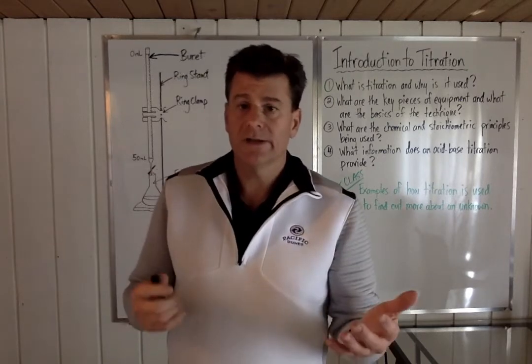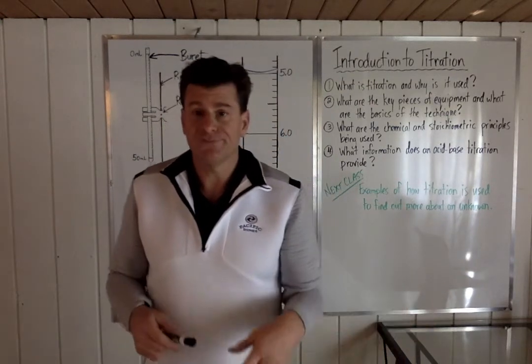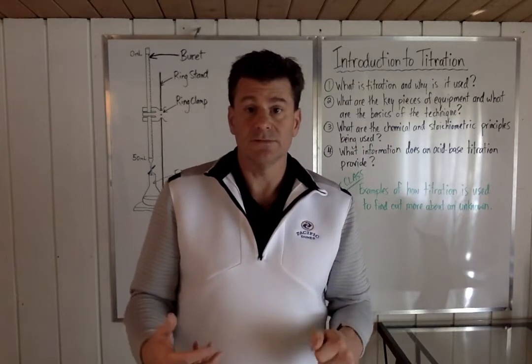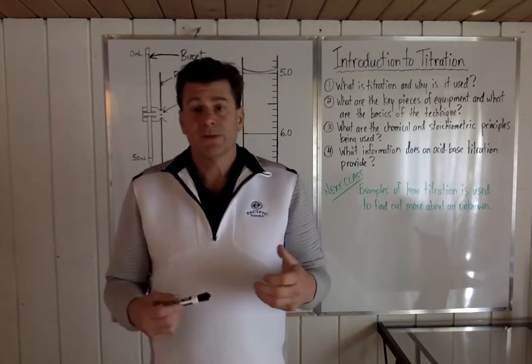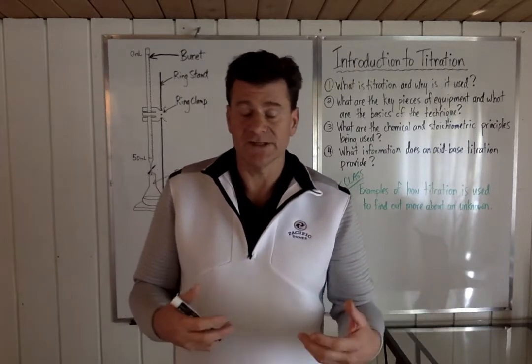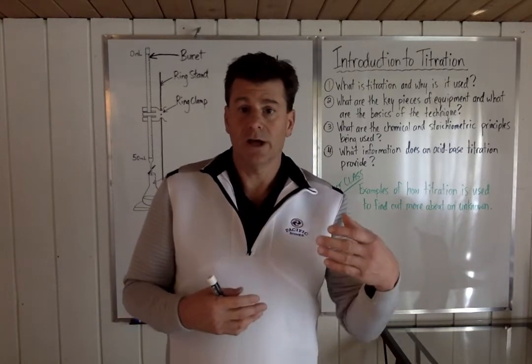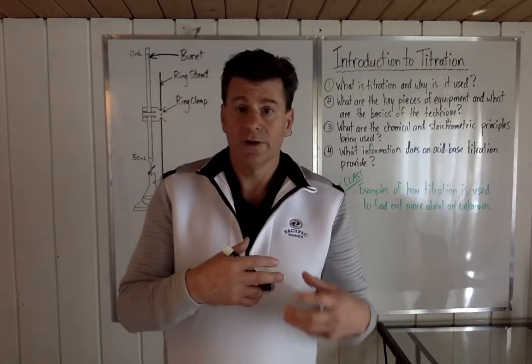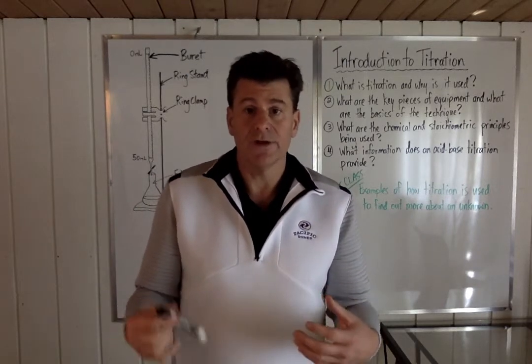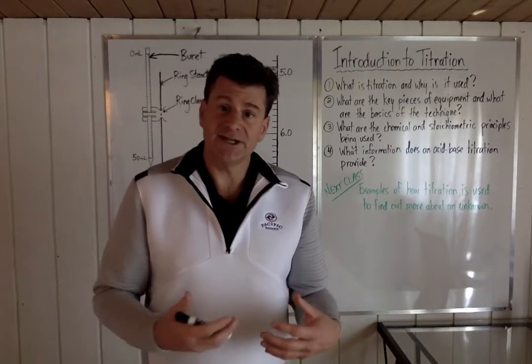Okay, so let's start off with what is titration, and essentially, why is it used? Like, why bother? So titration is a laboratory technique that is used for the analysis of an unknown reactant. What you're trying to do is mix two chemical reactants to do a chemical reaction, obviously. But you're trying to figure out the number of moles of an unknown reactant in solution or in a solid chunk. And you try to find out how many moles you have of that unknown by reacting it in a very controlled fashion. And that's what titration is. It's a very controlled addition of another reactant.